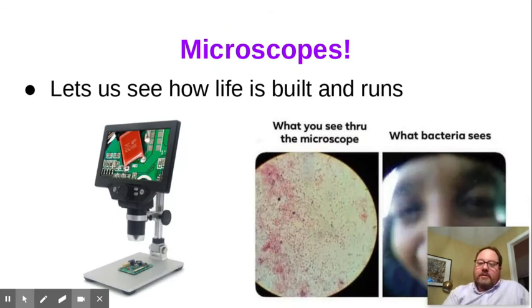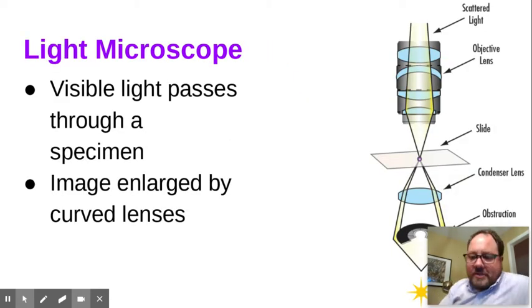Now, how do we get an idea of what these structures are and how they work? We've been able to get greater access to understanding through development of microscopes. Through microscopes, we can enlarge and see images of stuff we couldn't normally see. Now, this is stuff that's not on the AP curriculum, but I think it's helpful for providing context for how we see the images we see.